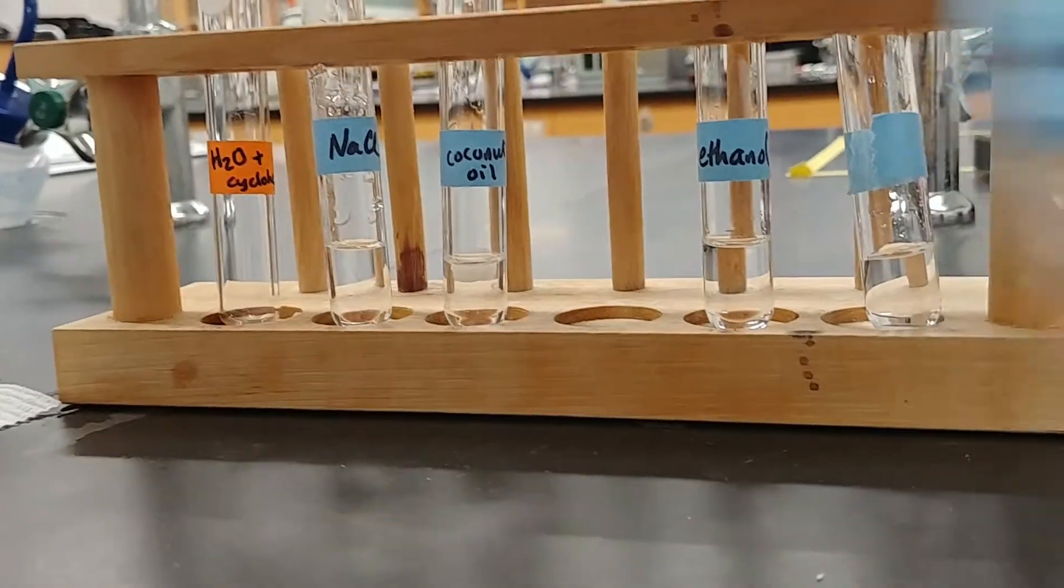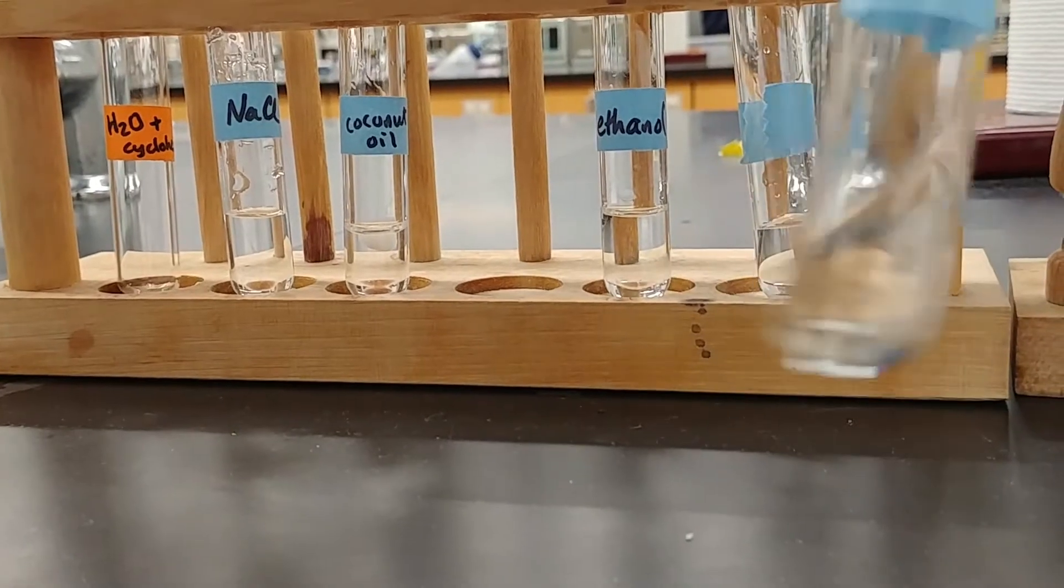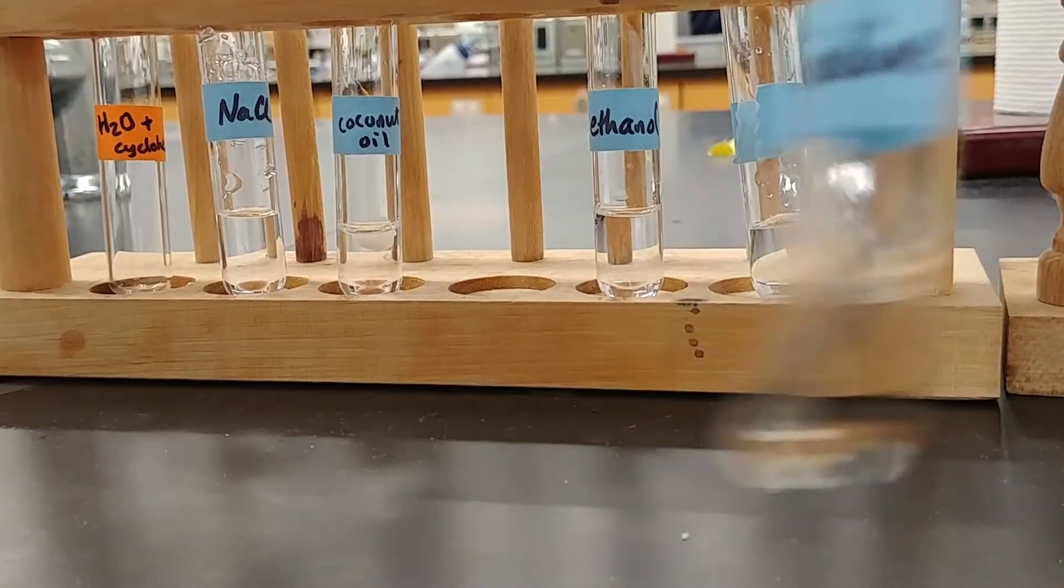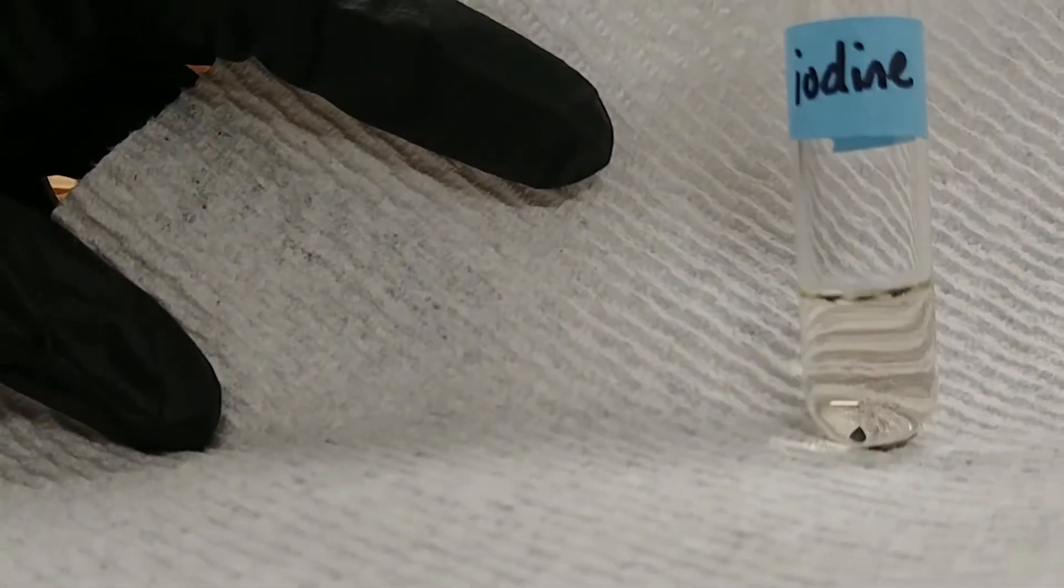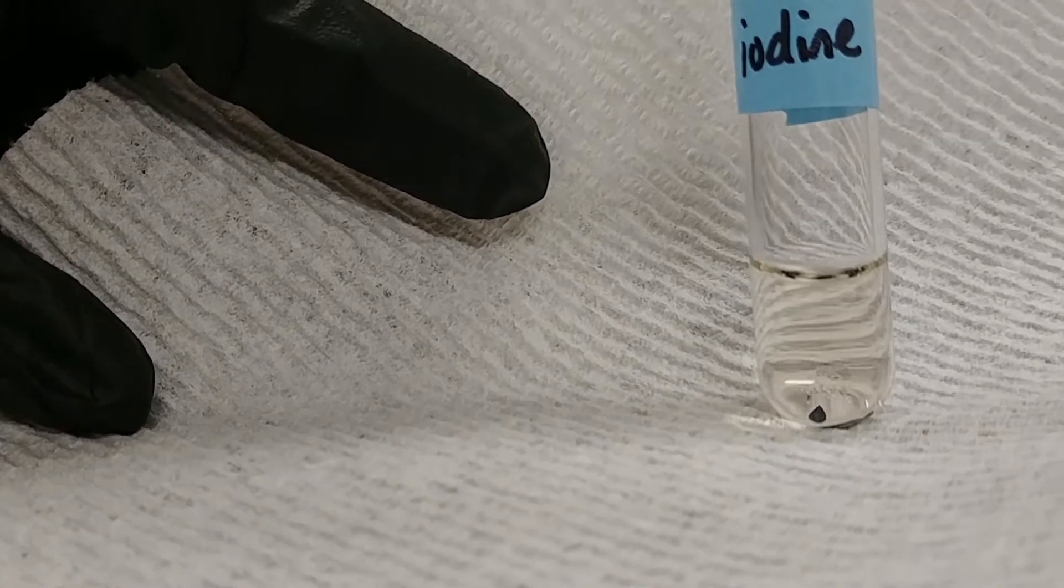Next is the iodine. This one is sometimes a bit interesting. I like to put something white behind it so you can see something a little bit interesting going on there. The iodine sort of very faintly colors the water.